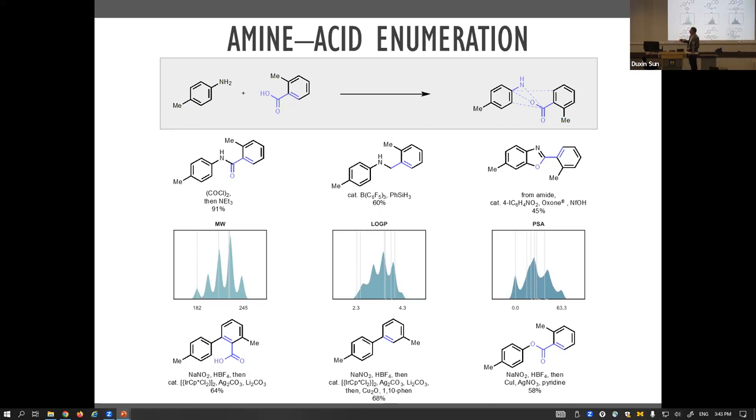We have a boron catalyst that reduces it down to make a basic amine. We've borrowed conditions to make this using an iodine catalyst to make these really aromatic and rigid compounds. Using Goossen conditions, we can form an acidic compound, and if we work up those conditions with copper and heat the bejesus out of it, it will decarboxylate and give us this very lipophilic compound.